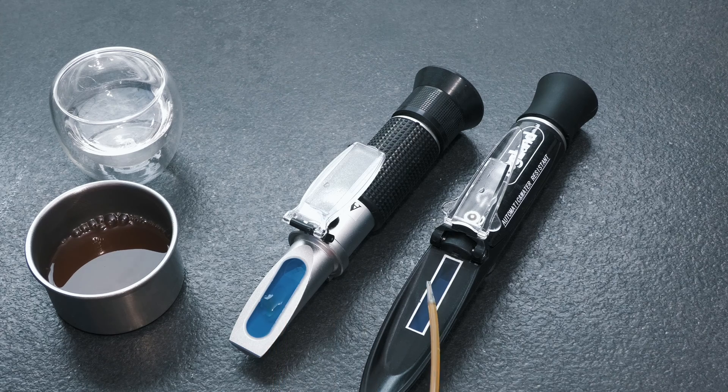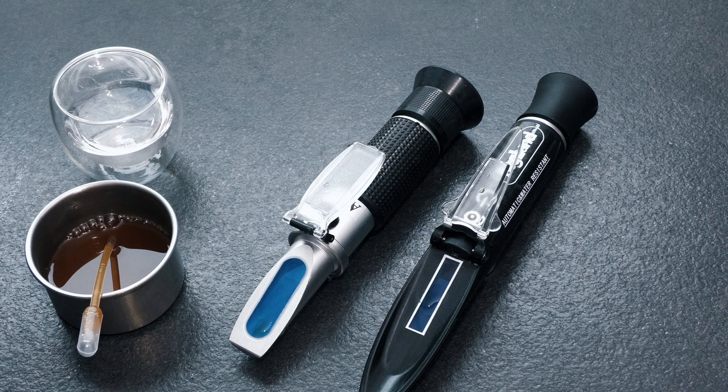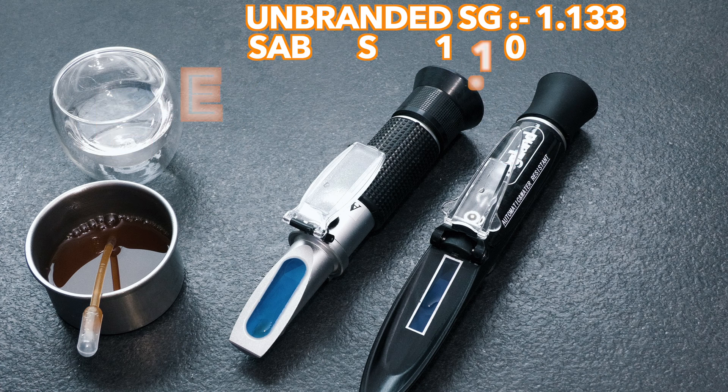Let's now bring out both of our budget refractometers and see how they handle something this high in gravity. I added this higher sample to both and here are the results. Firstly, our budget unbranded blue box refractometer returned a result of 1.133, which is 18 gravity points above the accurate reading taken with the SmartRef. Secondly, our Kegland Sabre came back with a reading of 1.120, which is 5 gravity points above the accurate reading taken with the SmartRef.